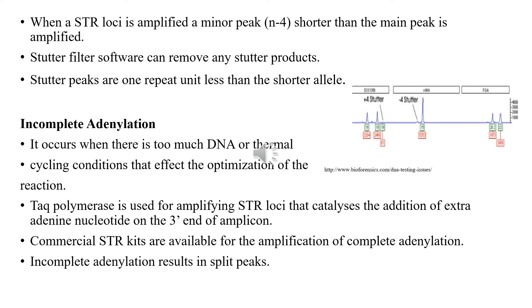Incomplete adenylation occurs when there is too much DNA or thermal cycling conditions that affect the optimization of a PCR reaction. Taq polymerase is used for amplifying STR loci, which catalyzes the addition of an extra adenine nucleotide on the 3-prime end of the amplicon. Commercially available STR kits have been optimized for complete adenylation. Incomplete adenylation results in split or double peaks, and the genotyping software may call one of the alleles as off-ladder or a microvariant allele. The analyst then edits one of the alleles from the electrophoreogram.